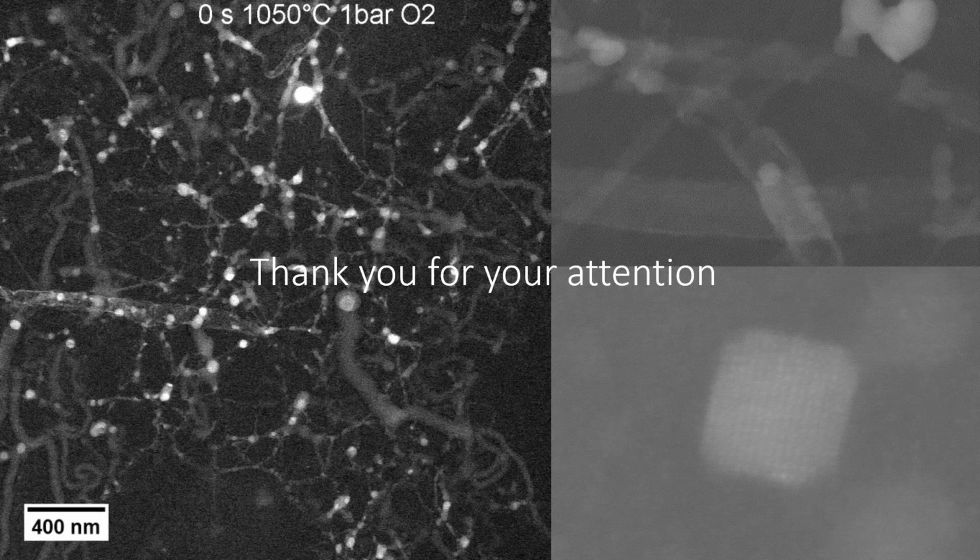And after this, normally when we are using gas, we also need to vacuum the pipelines, because initially your gas pipelines are in the air, and now you connect to our system. So there is still some air inside. If you don't pump this air away, it will also confuse your experiments. You can keep these two together and pump them. And for the mass spectrometer, there is a bake-out system, which will also first bake out the water in your system.